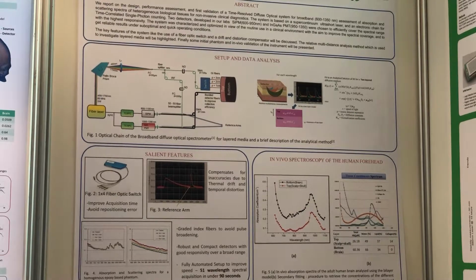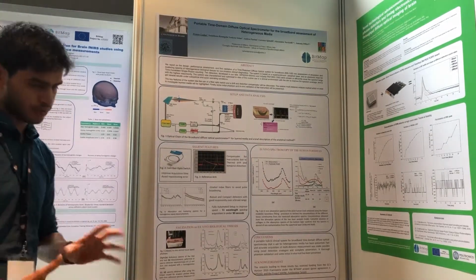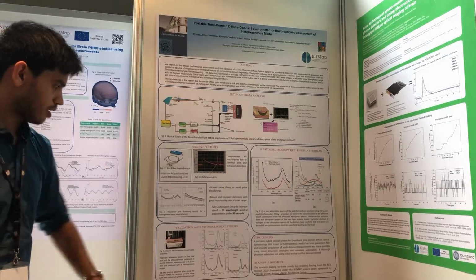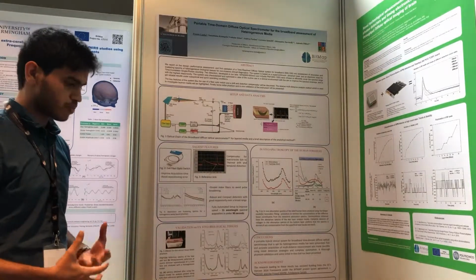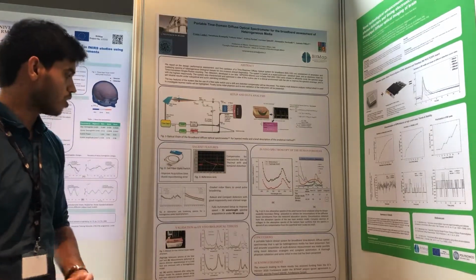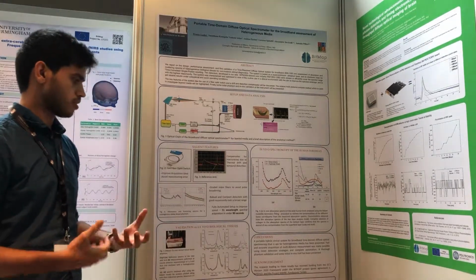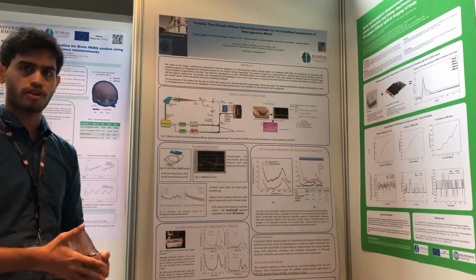Then we went on to perform some validation on heterogeneous media. So this is biological media comprising ex vivo animal tissue. For the top layer we considered veal, and for the bottom layer we considered lard tissue. These here are the reference homogeneous spectra. These are measurements made on bulk samples of these two materials and analyzed using a semi-infinite model fit. And here these are the spectra using the combined meat sample as a two-layer media, measuring on it again and analyzing it using a semi-infinite model fit.